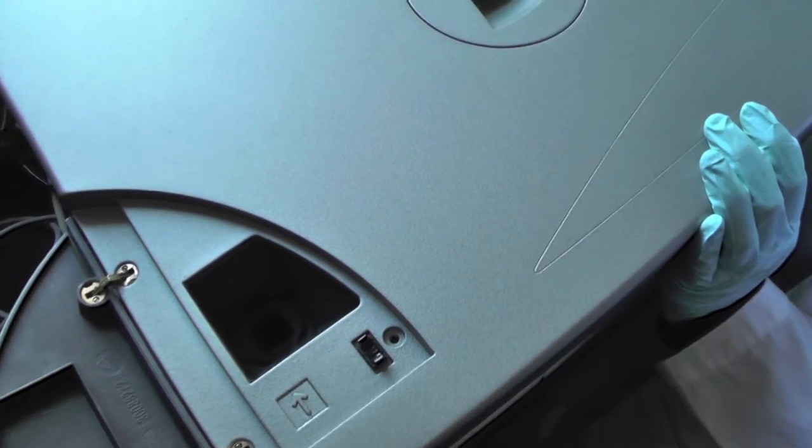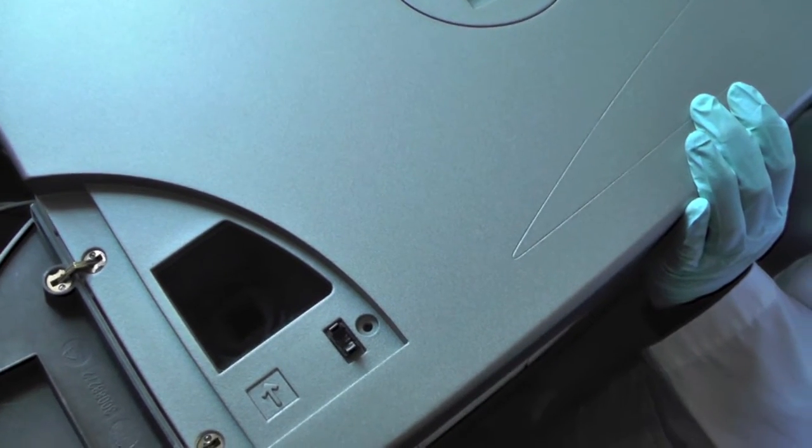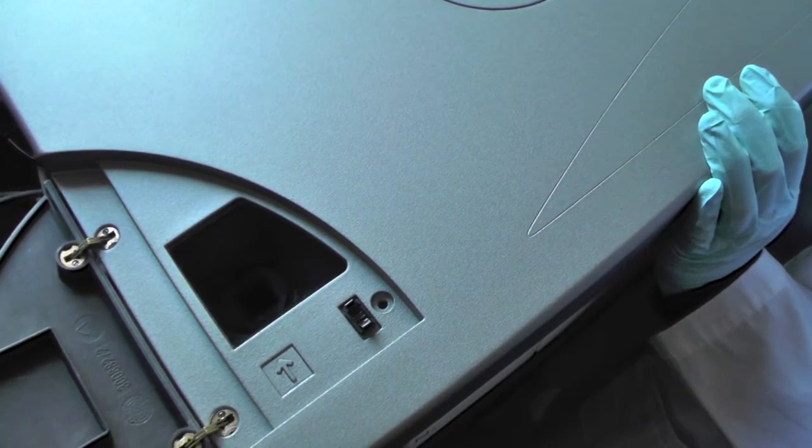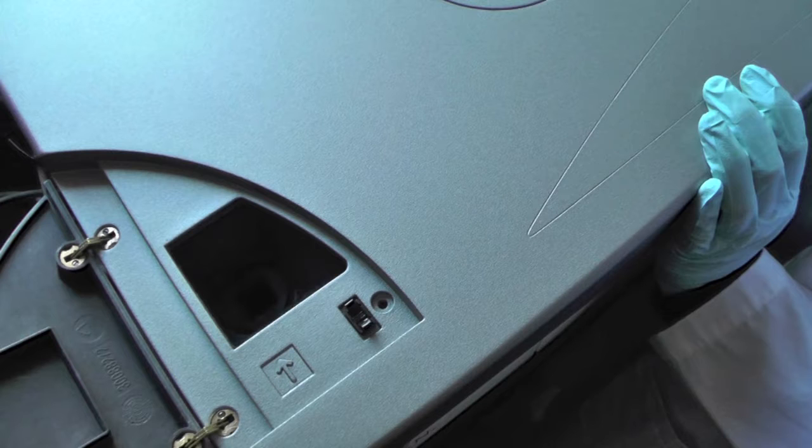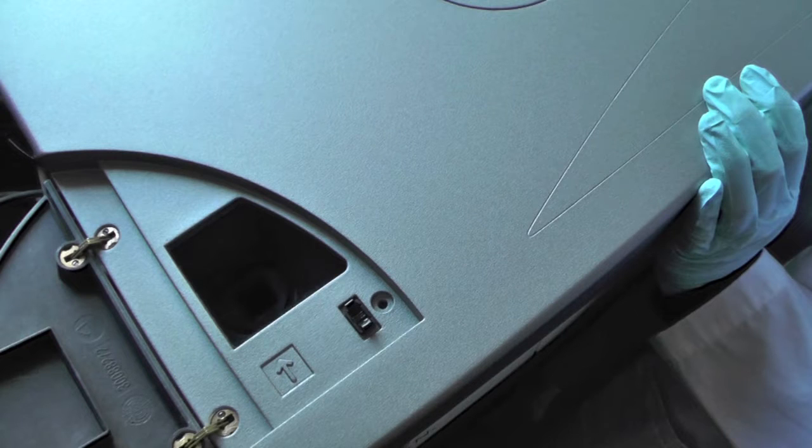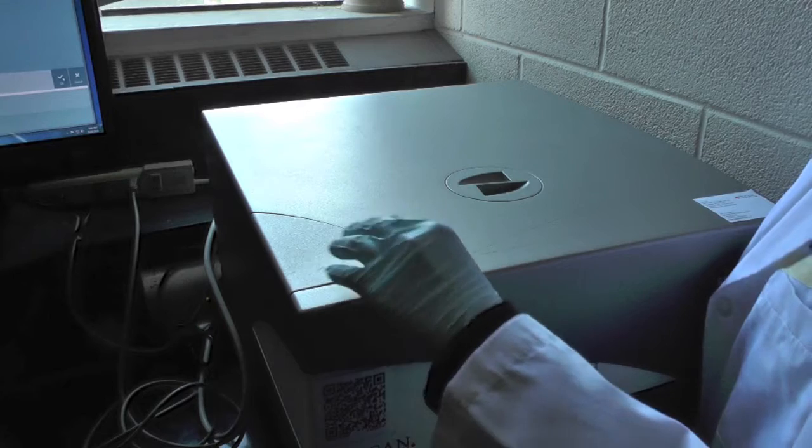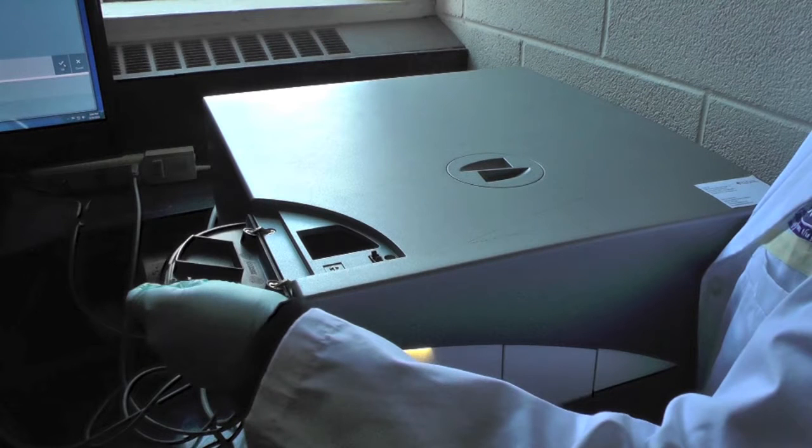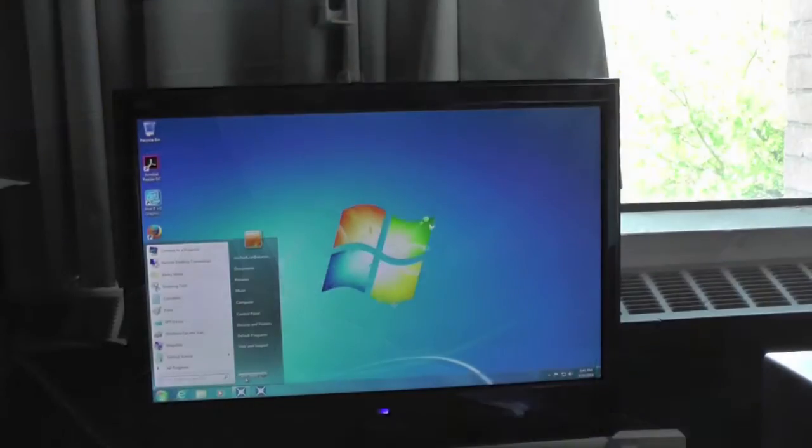The cuvette port is located on the left of the instrument and an arrow on the instrument indicates the direction of light path. Once prompt, place your blank solution in the cuvette port and continue to follow the instruction on the screen.